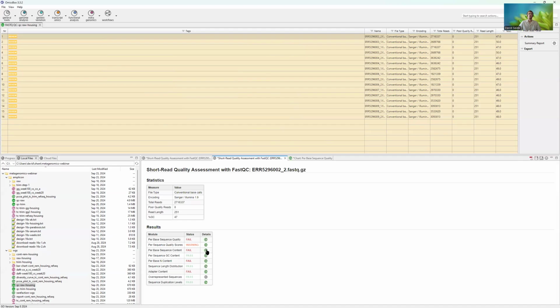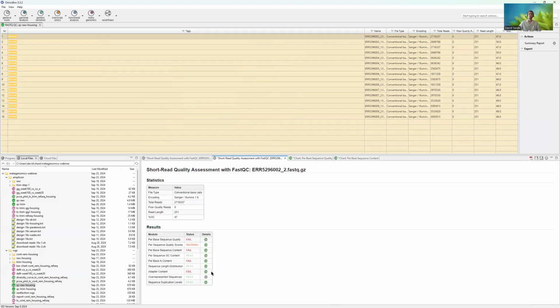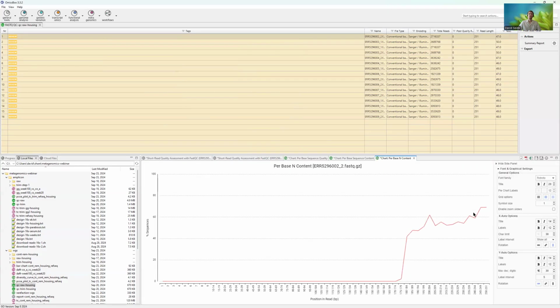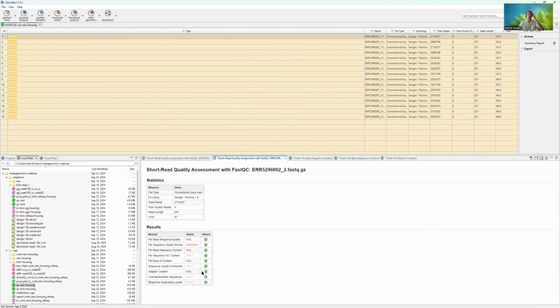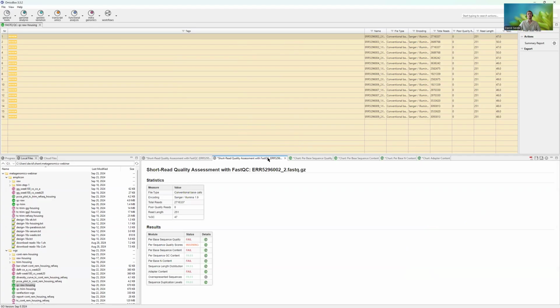The per base sequence content looks a lot better. Yeah, it's a flat line. We have some bias here in the end, and there is something related to primers, I guess, in the beginning. We have some Ns toward the end, nucleotide unknown, and something is going on with the adapters. So someone didn't do their job. The adapters have not been removed. We have Nextera adapters. Okay, so we have to get rid of all that because the data is very noisy.